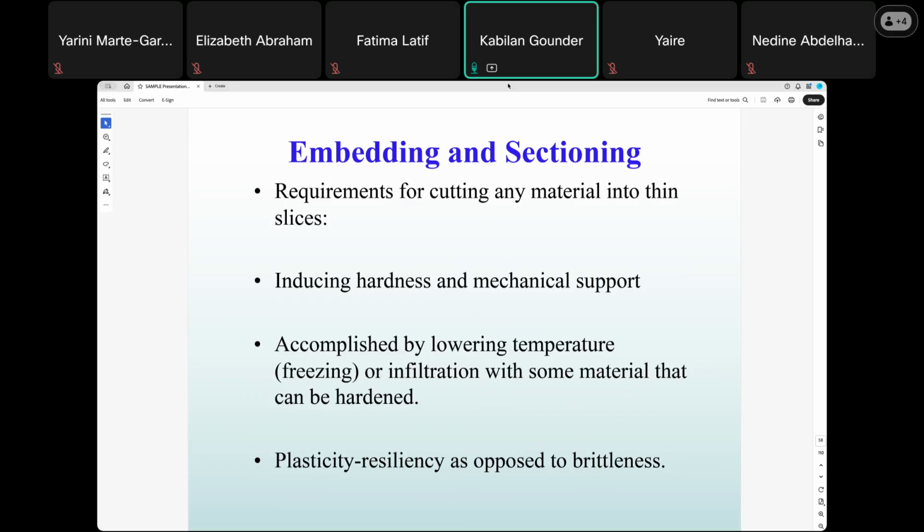For light microscopy, we use paraffin. Paraffin is like candle wax, so we can use that to hold your samples. If it holds your samples, it has to be aligned and penetrate the tissues that you are going to take as sections. To facilitate the paraffin wax into the tissues, we can add some chemicals that give an opportunity to penetrate.